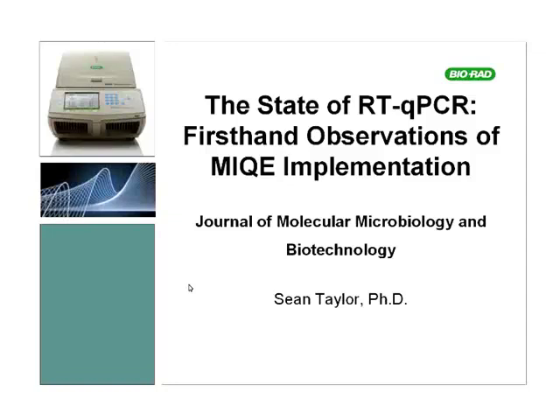We're very happy to announce the release of this new article that we've just published in the Journal of Molecular Microbiology and Biotechnology, entitled The State of RT-qPCR: First-Hand Observations of MIQE Implementation. So I'm going to walk you through this quickly.